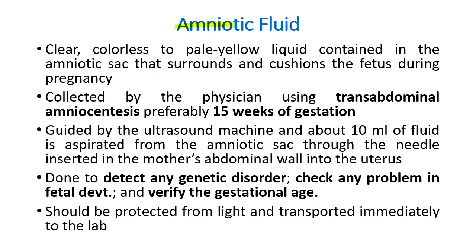So next we have amniotic fluid. So ano yung amniotic fluid? It is a clear, colorless, pale yellow liquid contained in the amniotic sac that surrounds and cushions the fetus during pregnancy. So it is collected by a physician using a trans-abdominal amniocentesis, preferably 15 weeks of gestation.